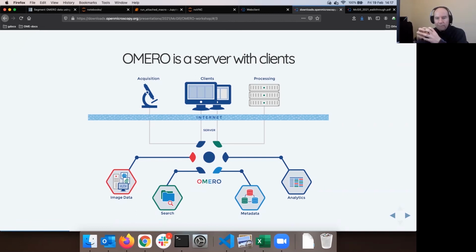The question is about the servers which we are using now here, because this is a super special situation we are in. This is not the typical situation. We are in a workshop situation, and we have a server which we used yesterday, which is generally called a training server. Its name is Outreach. So how about that one?